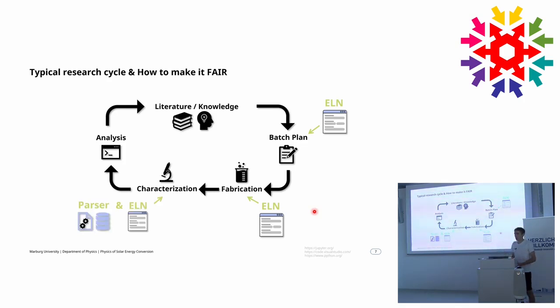You just upload your files and basically get an automated analysis. And this automatic analysis you can do, for example, with NORTH. Pepper said, I haven't used NORTH yet. What I always do is I use the application programming interface of NOMAD, which means I make some API calls to our server, get the data back, run a standardized script, and then get all the plots locally on my computer. But it should also be possible in the NORTH tools.